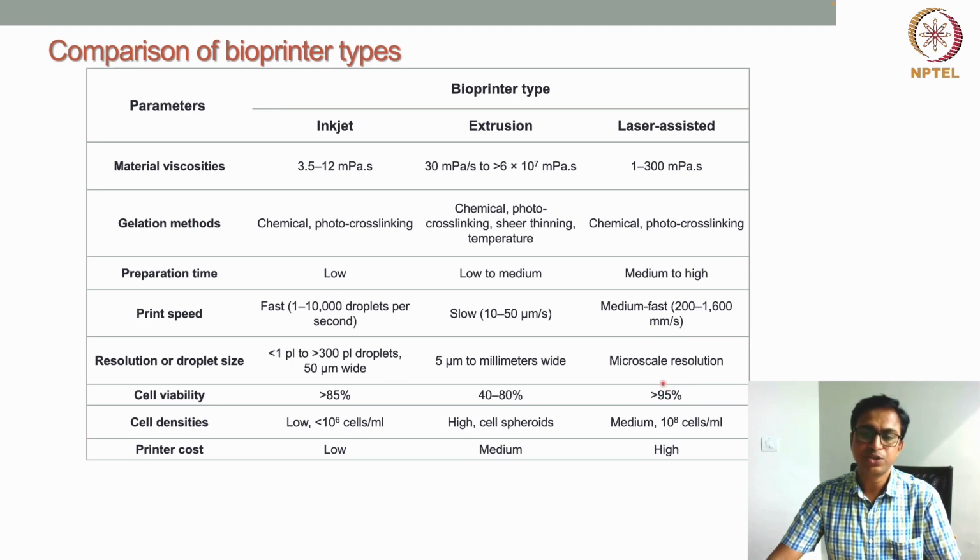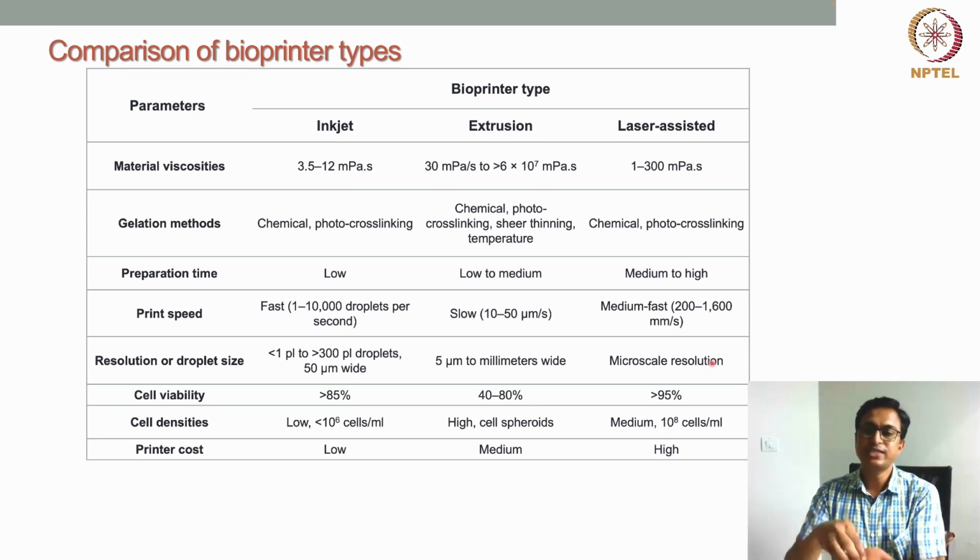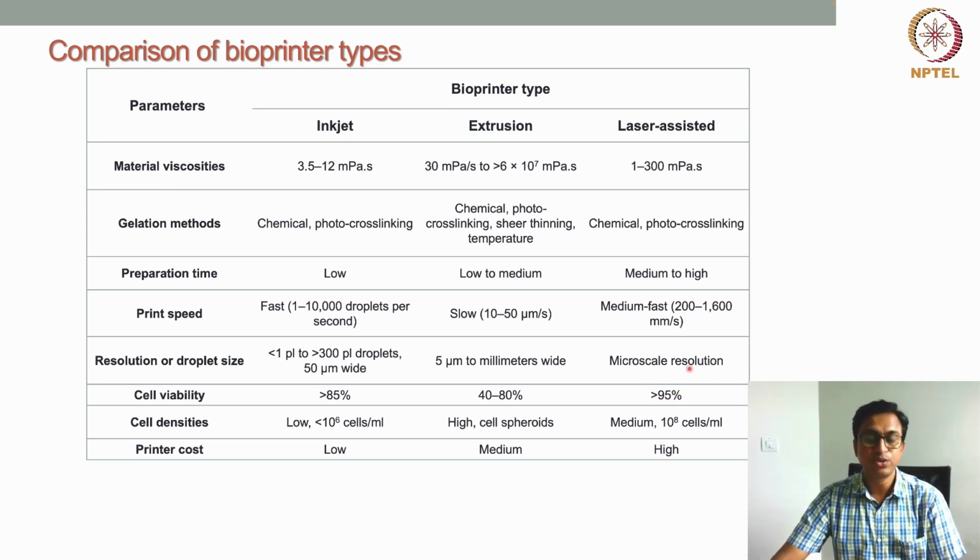With this kind of bioprinters, similar to inkjet based bioprinting, we can generate droplets containing single cells, and then those single cells can be patterned as per the requirement, and we can create a very nice multicellular architecture of a particular tissue, right? So that's why these two printing technologies are very good in this regard.